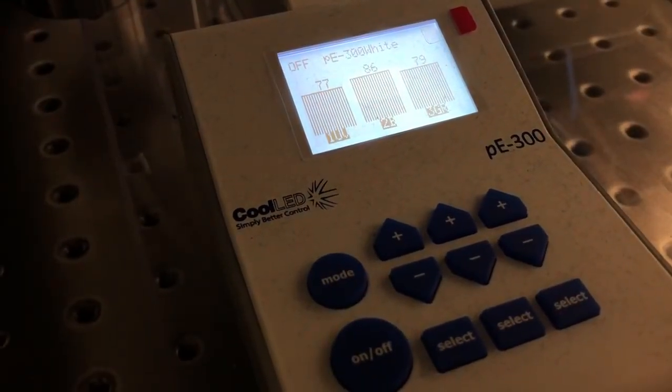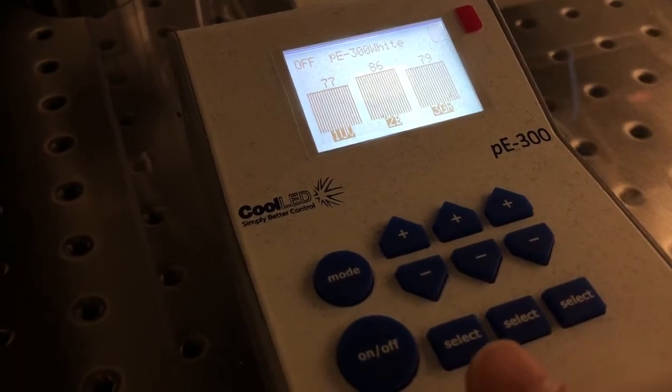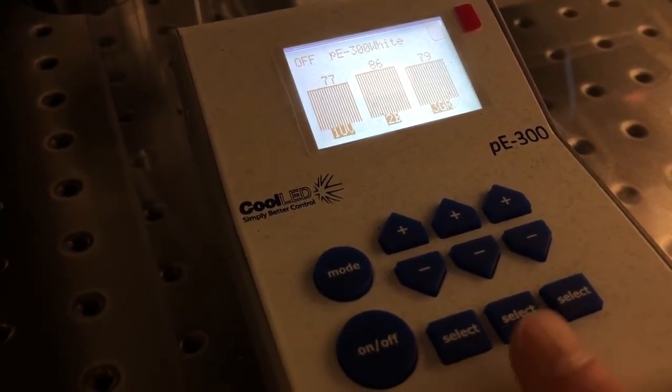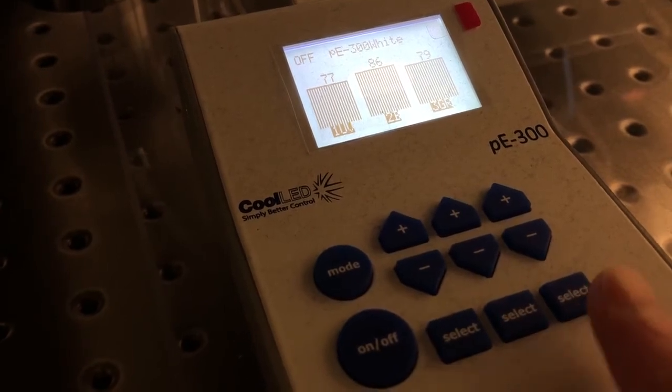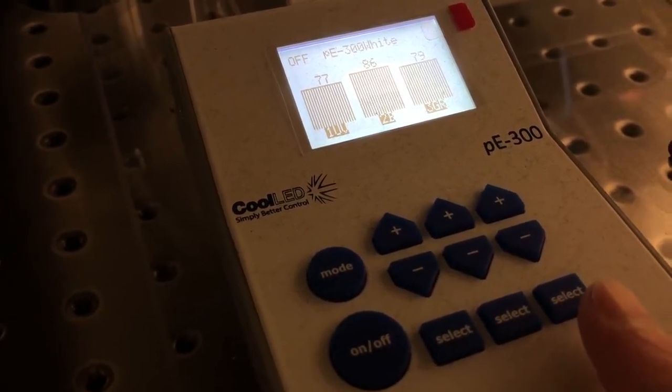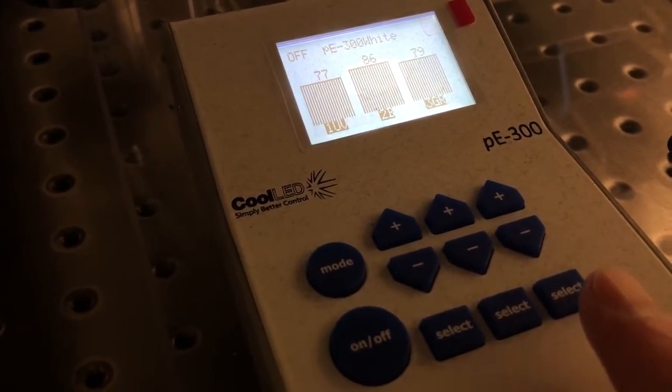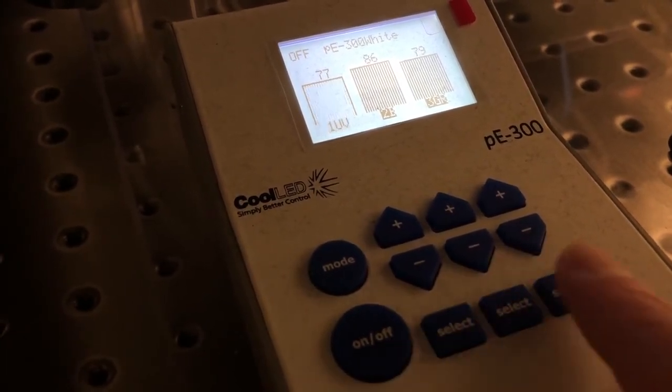One final note about this illumination system is that it has actually three LEDs. One that is necessary for DAPI, another for GFP, another for RFP or similar fluorophores, and by default they will all be turned on, but if you want, you can turn off ones that you are not using.